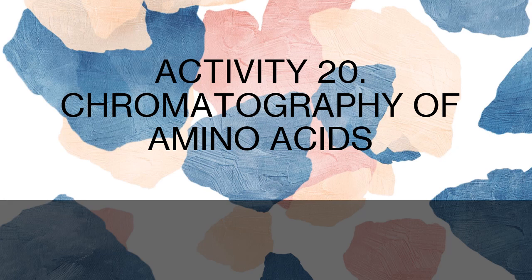Chromatography involves a sample, or analyte, that is being tested. The sample or analyte is dissolved in a mobile phase, which is either a gas, a liquid, or a supercritical fluid. So your mobile phase here is a fluid. The mobile phase is forced through an immobile, or stationary, phase. The phases are chosen such that the components of the sample have differing solubilities in each phase.